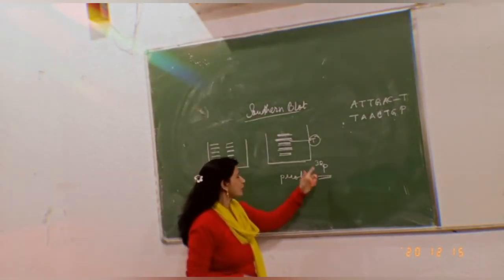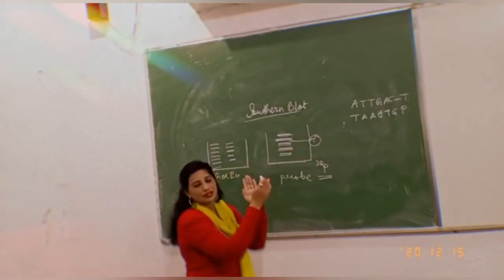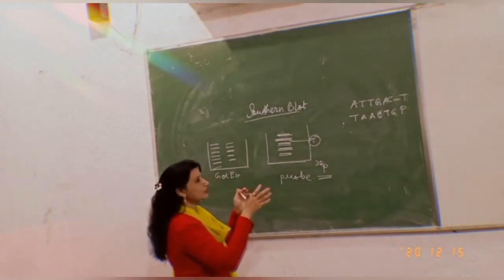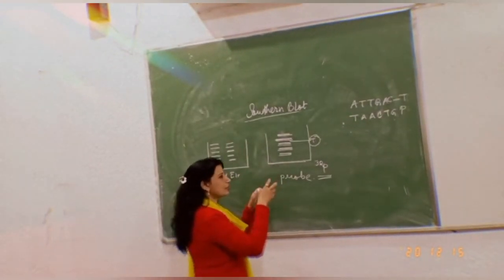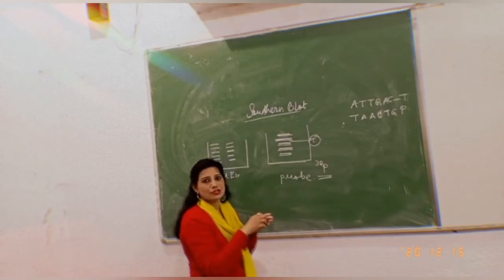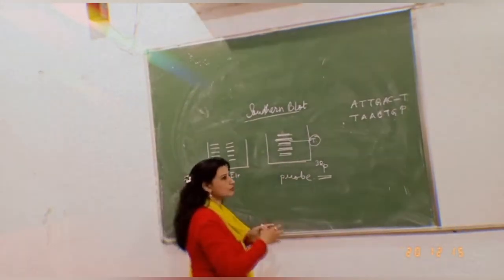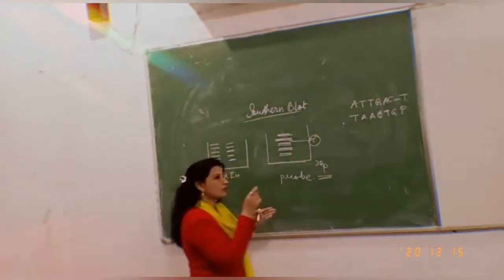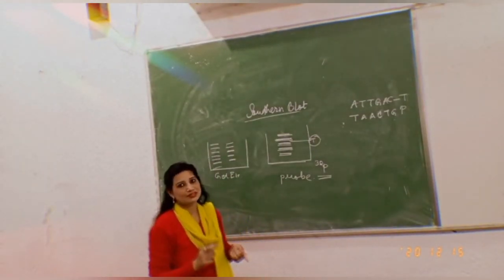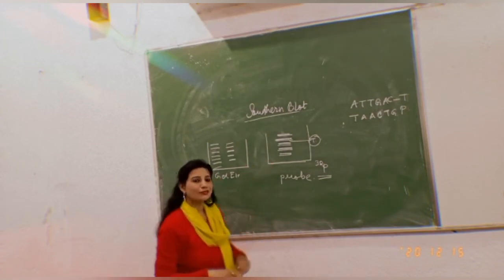Right now, I have to first make it single stranded, then with the help of the probe, because all I need is my target. Without that, the probe will not be attached. So it will get attached to a particular one, because here I have to locate a particular DNA sequence. When I do this, the probe will attach to a particular DNA molecule, which is my target, because it will match with that one only. It will not match every strand.